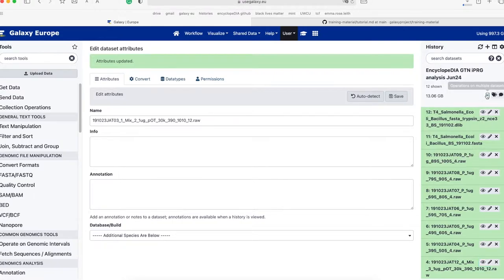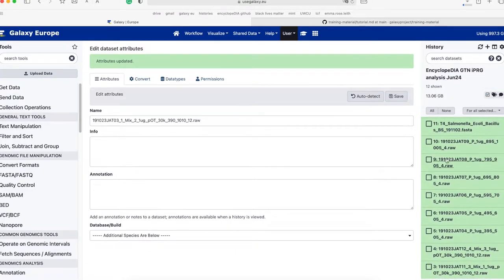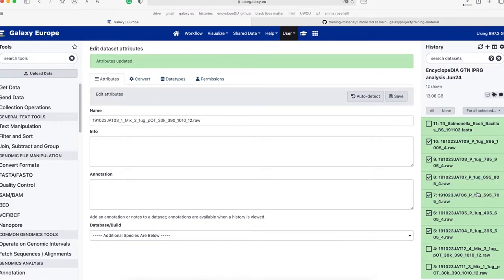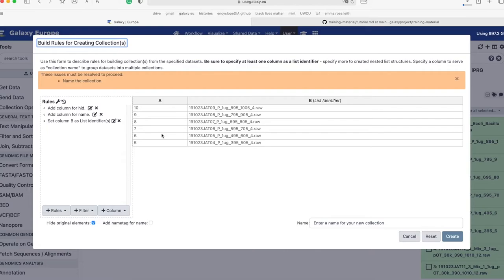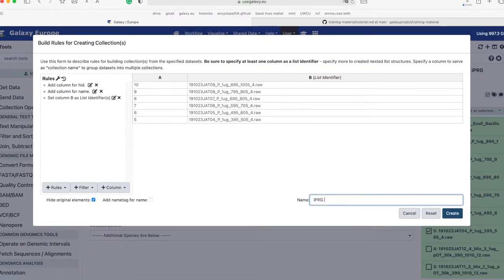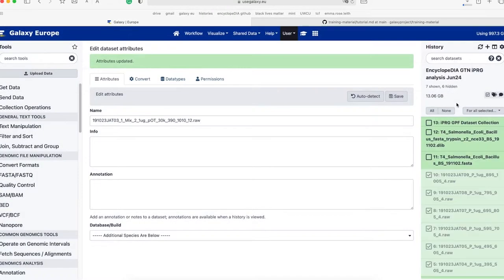To accomplish this, click the checked box in the right corner that says 'Operations on Multiple Datasets.' Then check the GPF files — you will check six boxes. Once selected, click the 'For All Selected' tab and then select the 'Build Collection from Rules' option. When the dataset collection window pops up, add an informative name to the collection. In this case, I am going to name it 'IPRG GPF Dataset Collection.' Then click Create.